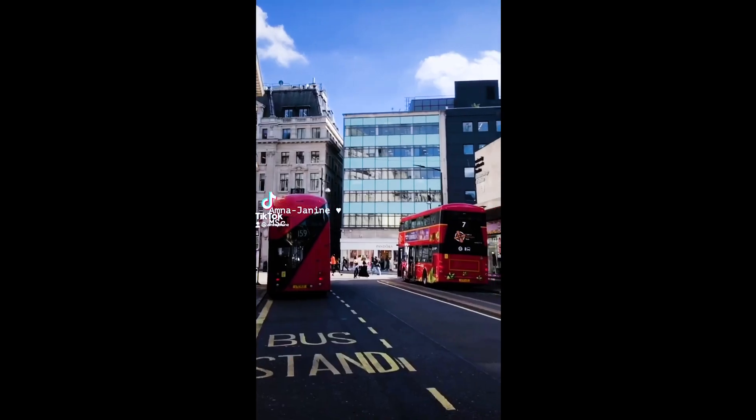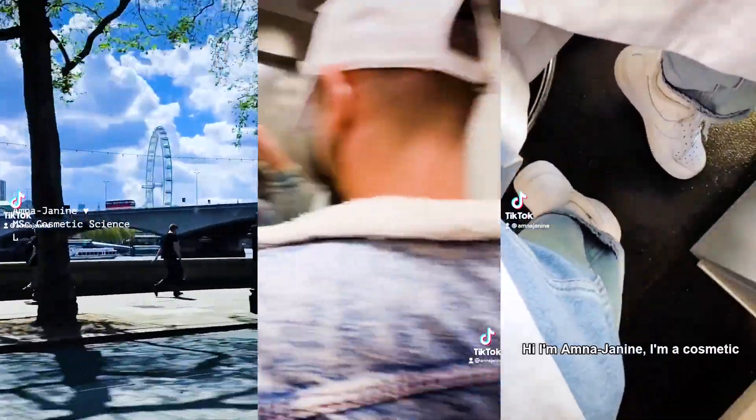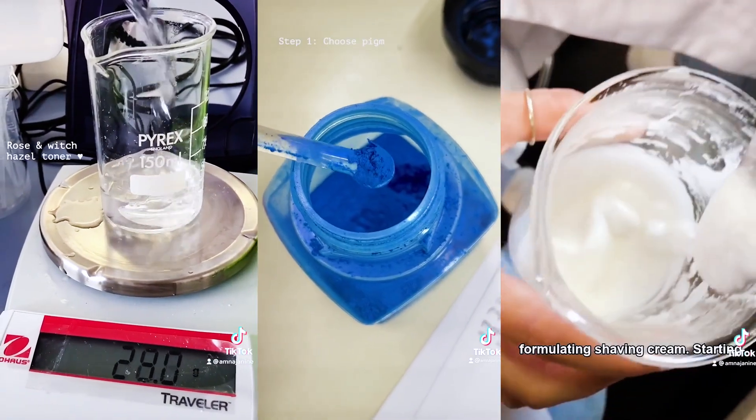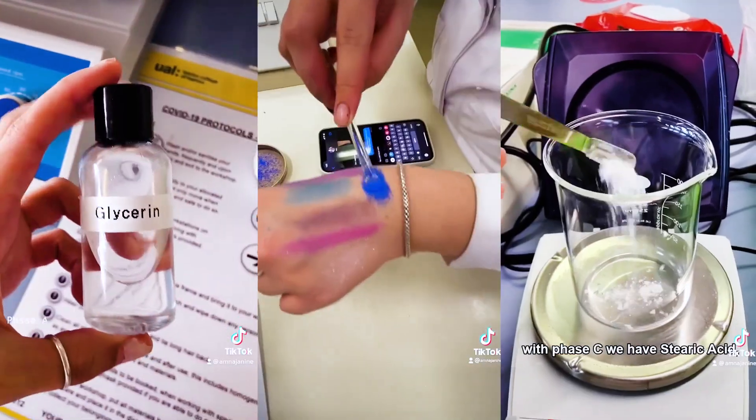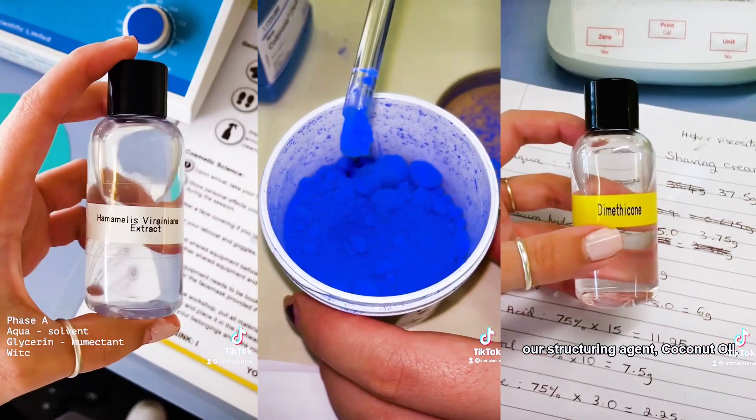Hi, my name is Amna Janine. I'm an MSc Cosmetic Science student at London College of Fashion. And this is Come to Lab With Me, eyeshadow edition. First things first, we had to choose a pigment and pearlescent. So we went on a little swatching spree and ended up going for this beautiful blue.